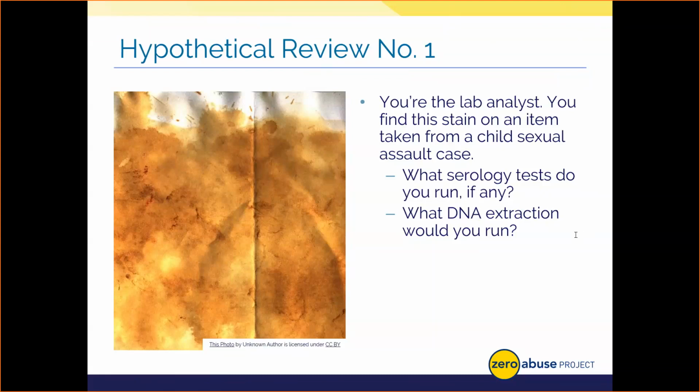Somebody said they'd test for blood and seminal material. I think that was Greg. Okay. Renee, saliva. Yeah, potentially. What kind of DNA extraction would we use? Somebody says feces, maybe.